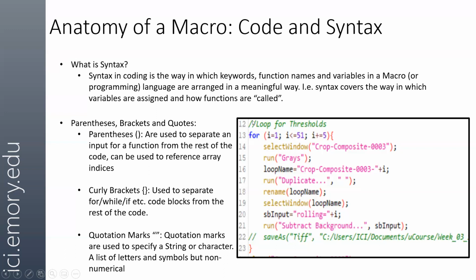And comments are, for example, green. Two forward slashes like this comment out the line. What that means is whatever the macro interface interprets, it won't see that line. It won't react to it. It's useful to have comments in code so that six months down the road, you can remember what that line did and why it was written that way, hopefully.